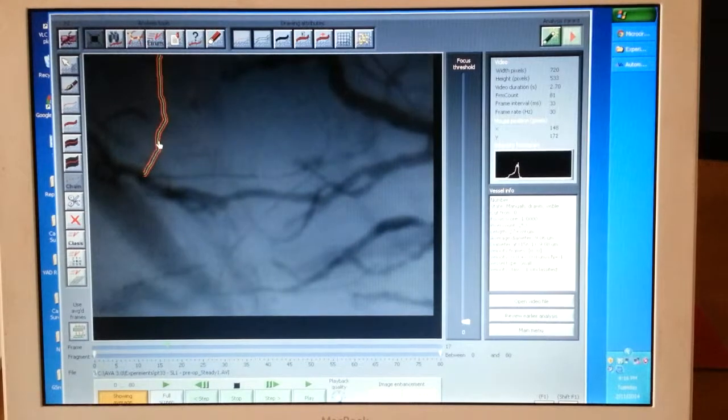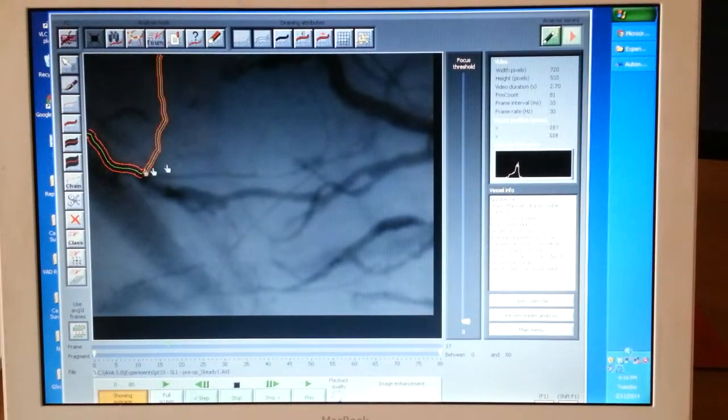So you've drawn that vessel, and let's say you want to chain that vessel. I think this vessel goes down and then joins this segment here, okay? So you've drawn this, and then let's say you want to continue drawing this segment here. Again, same thing. You draw that to about there where the intersection is. You release the mouse button. You pull away. You think, okay, that's approximately the thickness. And don't worry too much about getting the thickness exact. It's approximate. It's no big deal. So you draw that segment.